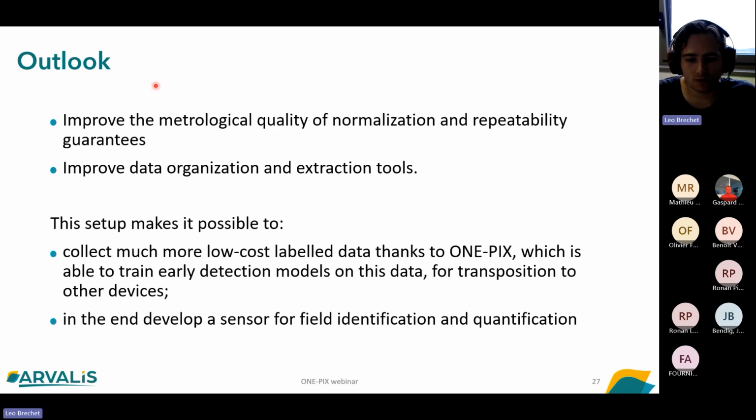And also, it is possible to think of a tool that guarantees an automatic data backup, because here the CSV has been made only manually during all the campaign.